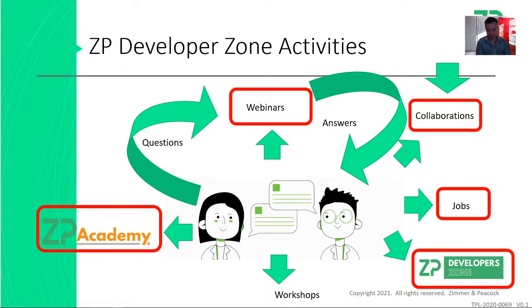But I'm also going to show you an EIS capability now in Djuli. Djuli is that online cloud database for electrochemical data. It allows you to upload the data, share the data, store and analyze the data. So we're also going to do a quick demo on Djuli.